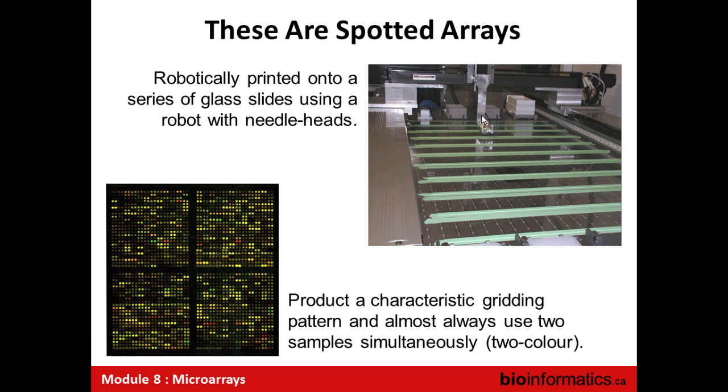Well, that was the first way that microarrays were ever made. It came from Pat Brown's lab in Stanford, and basically they were thinking about robotic ways of analyzing yeast better. And this is what they initially thought of. And one of the reasons why this type of array was so common is that they made all of their designs for the robot publicly available on what was then a very lightly used internet that was basically only for universities. So somebody would say, here is this science paper showing the first high-throughput expression profiling of an organism, yeast, and I want to do that. And they made their schematics for how to do this available, so I'm going to point my machine shop to it. The shop is going to go and make your robot. And literally thousands of microarray printing robots were built in that way using the schematics that they would put online.